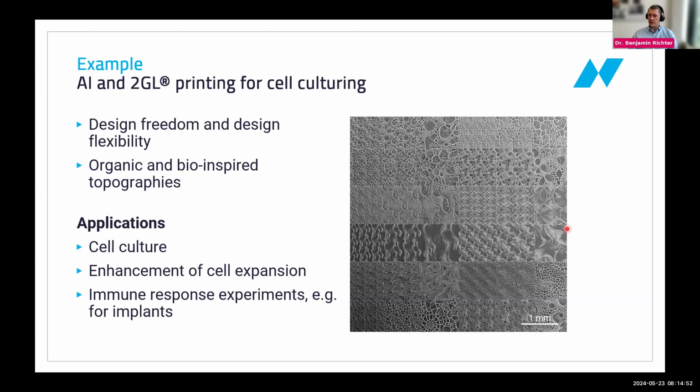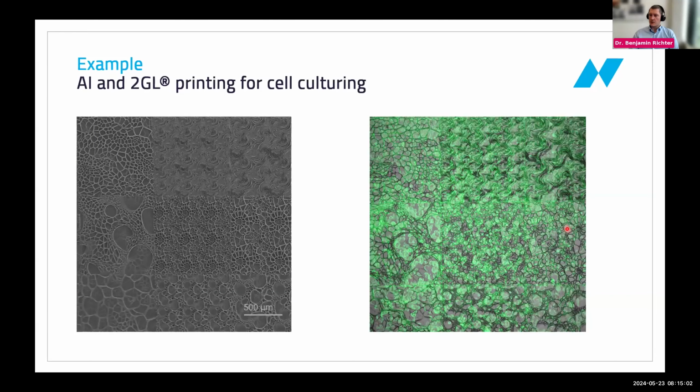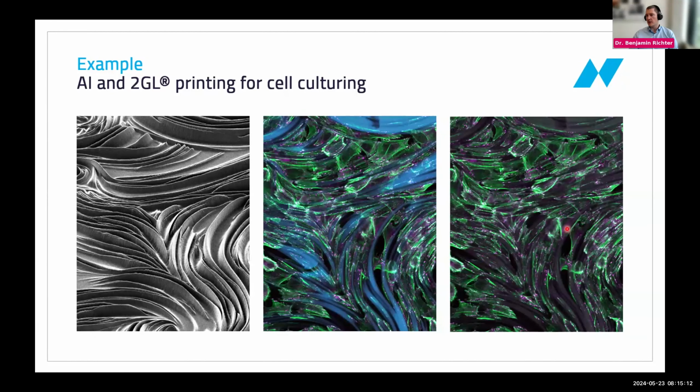And compared to the anti-fouling properties I showed you before with this pox-like structure in the Voronoi cube, you can now check: is there a surface texturing which my cells like most? So you can culture cells on these surfaces and then check how the cells grow. Do they like one surface over the other? And then you can texture 3D structures with these AI-generated surfaces.